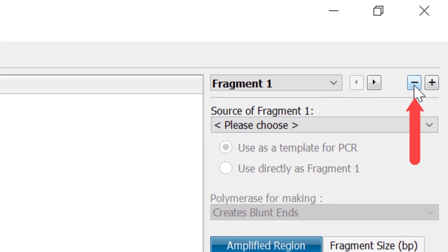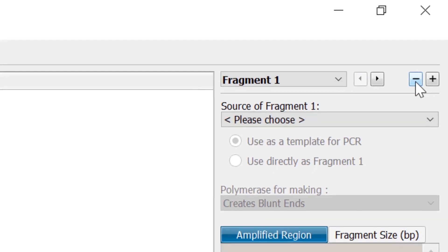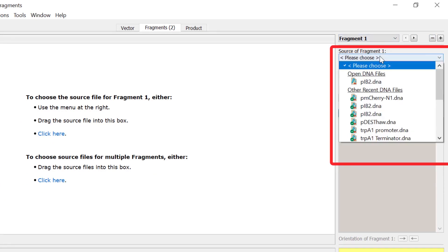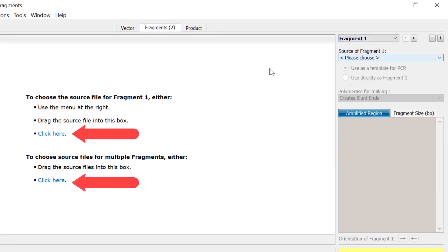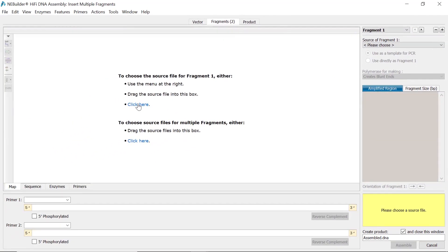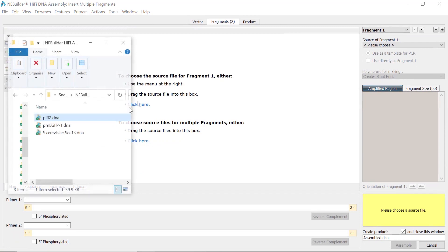Selecting the minus arrow will also remove a fragment placeholder. To import the fragment files, you can use the drop-down menu to the right or use the click here options. Alternatively, you can simply drag the sequence files onto the fragments window.